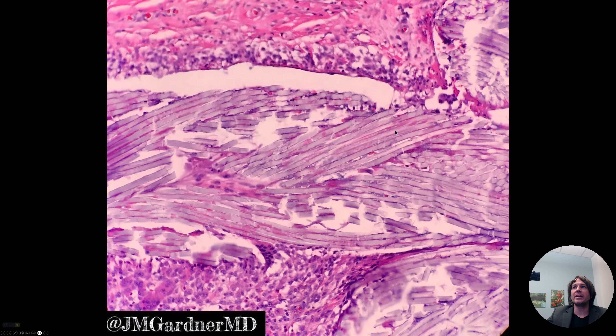This is actually braided suture material, synthetic suture — I think it was vicryl in this case. You can see all the little bundles of suture and how they're wrapped and braided together, and at the end here they're actually kind of tied in a knot.